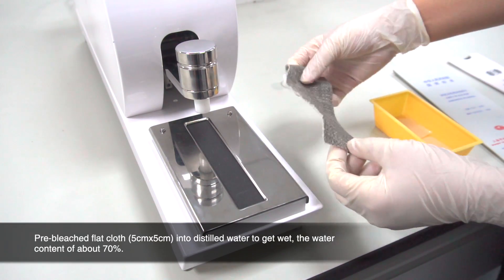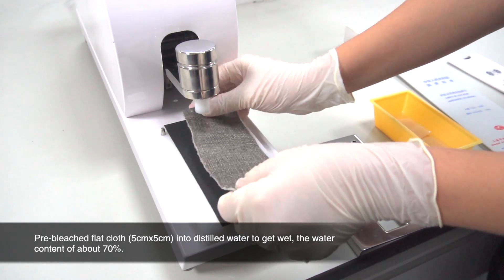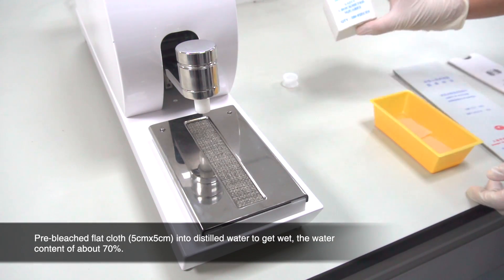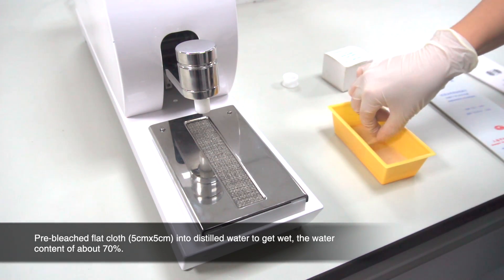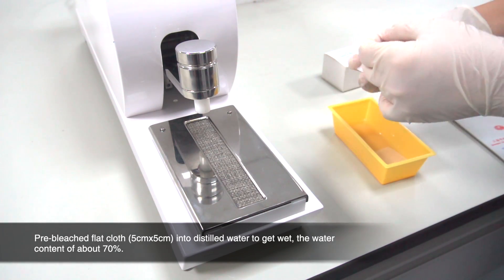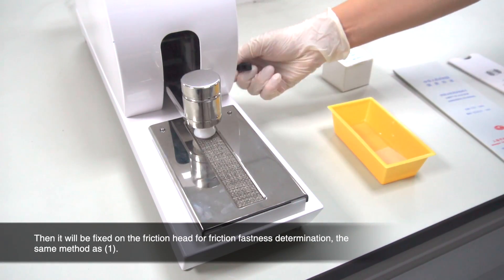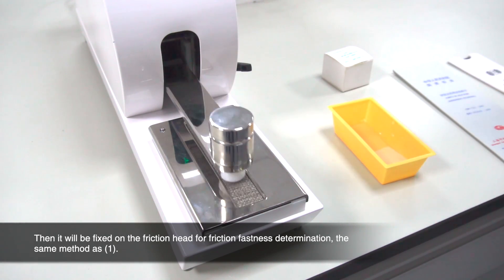Pre-bleached flat cloth, 5cm x 5cm, into distilled water to get wet, with a water content of about 70%. Then it will be fixed on the friction head for friction fastness determination, using the same method as the dry test.